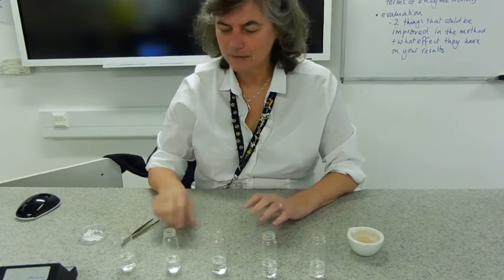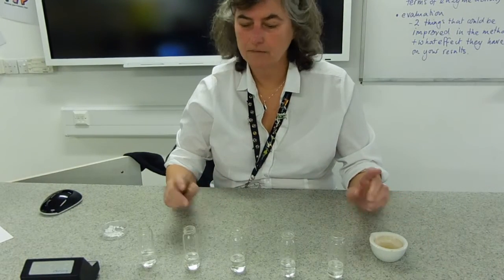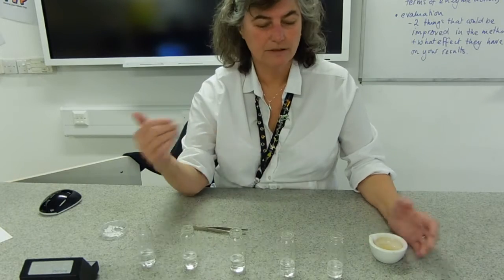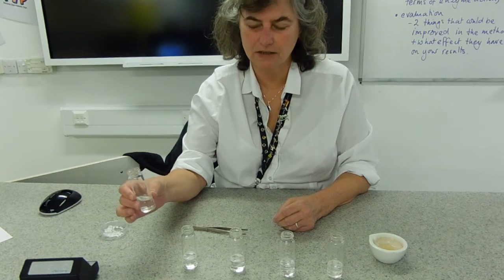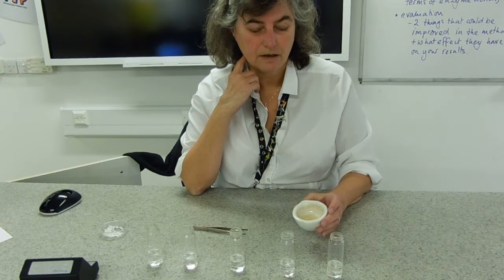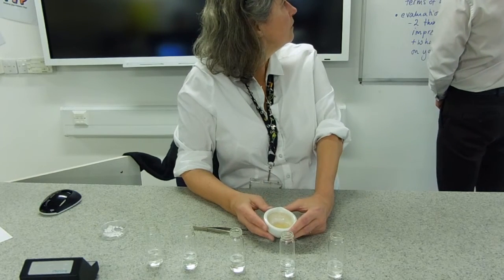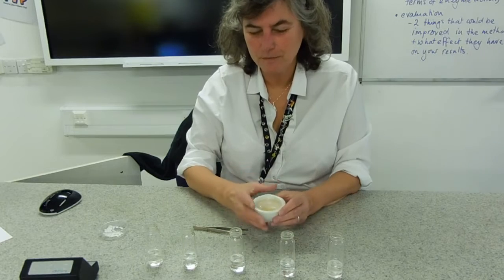This is the catalase experiment. You could have chosen to dilute your potato extract — I'm using a mixture of Grace and Caitlin's equipment and they've chosen to dilute the hydrogen peroxide solution. Your substrate — the thing that is going to be making collisions with active sites — is hydrogen peroxide, and your enzyme is the extract made with your potato. We made it with two centimetres of potato and five centimetres cubed of water, so this is a 100% stock solution.